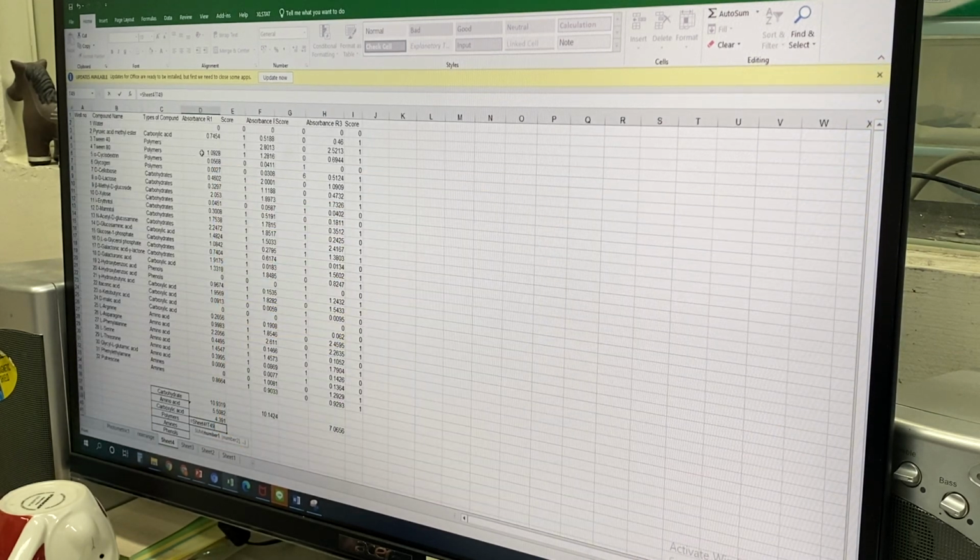Okay, I will show you. Suppose I give an example as 8-5, okay? Suppose this is, I just forgot the data, so I just put 9-5 or something like that, okay? It is my random example. So just go there and, according to the sum, polymer, okay? Just close this one.